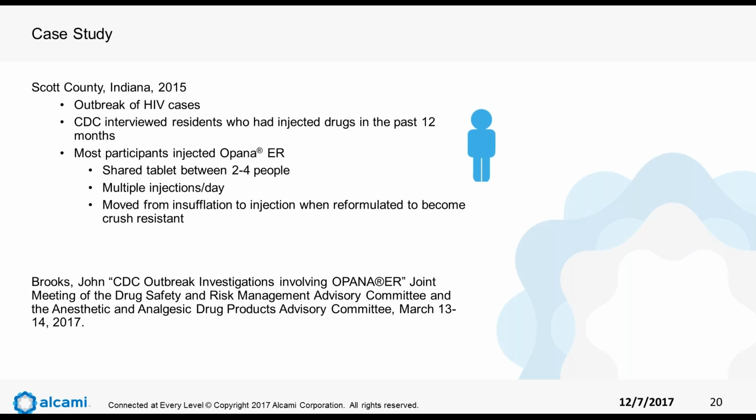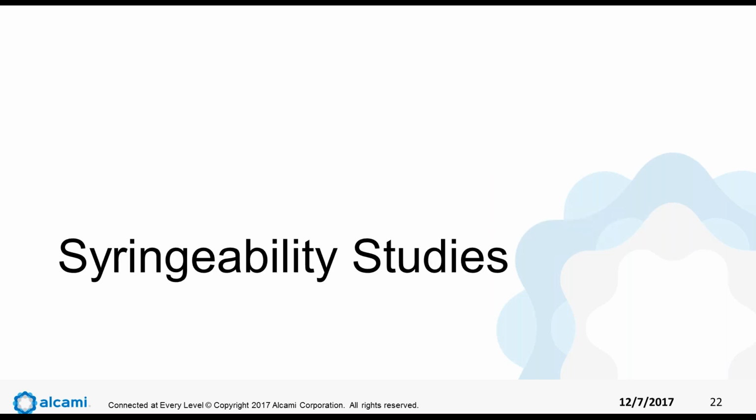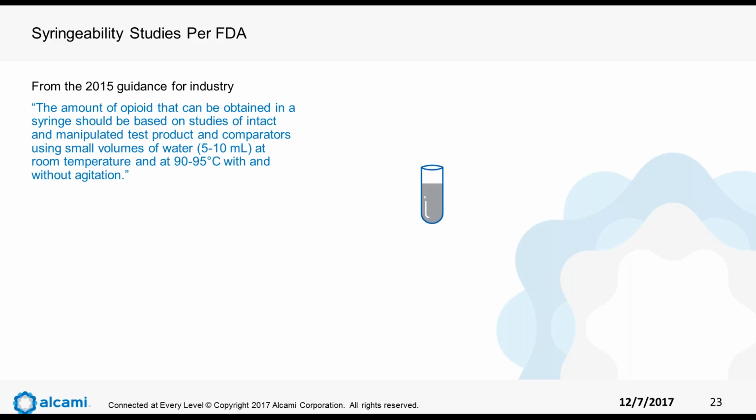Now, all of these cases that we just reviewed is what contributed to the recommendation of taking this product off the market. And I don't know about everybody else, but this always makes me ask, how do we prevent this from happening again? And the answer to that is through syringeability studies.